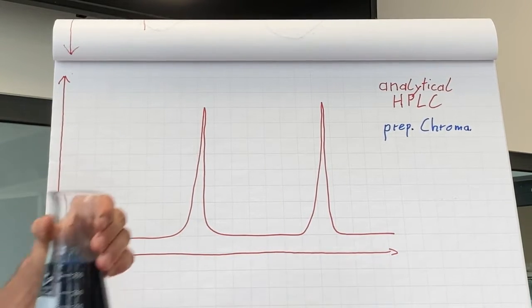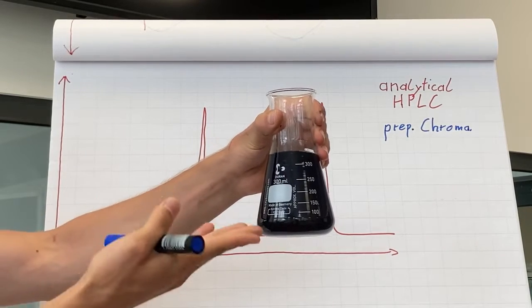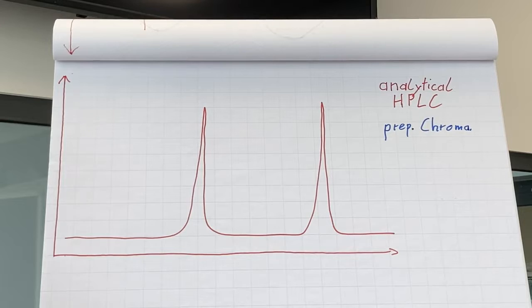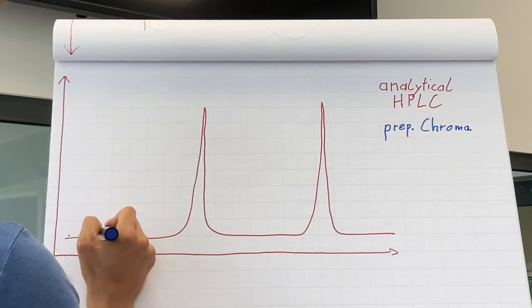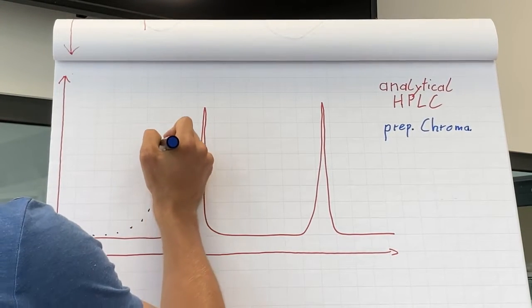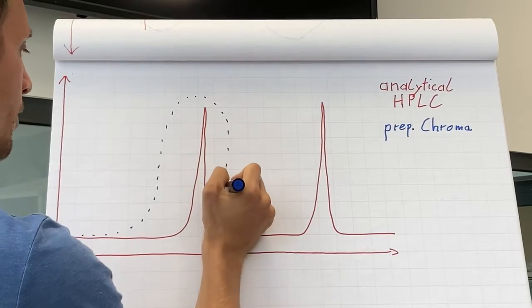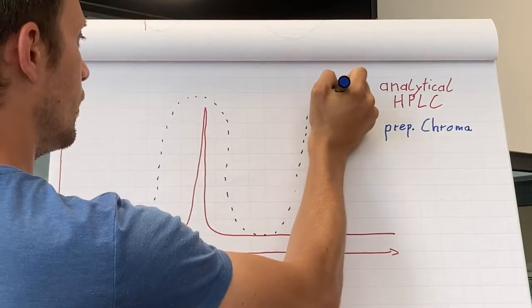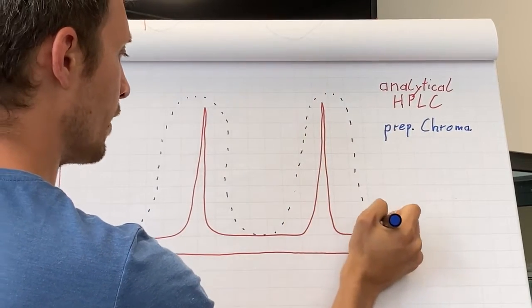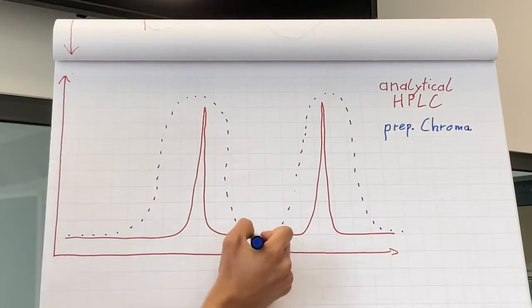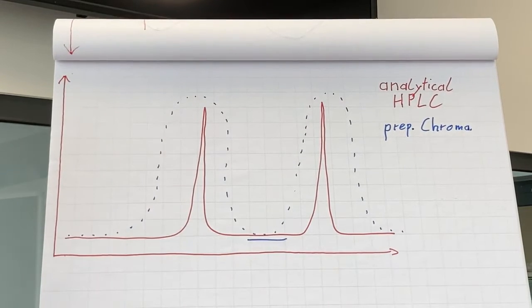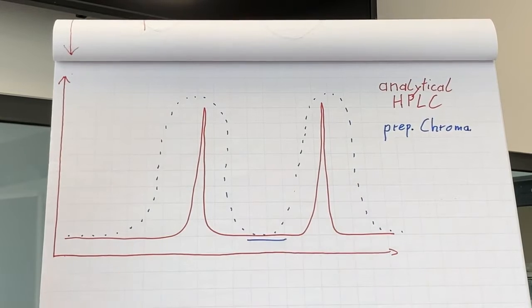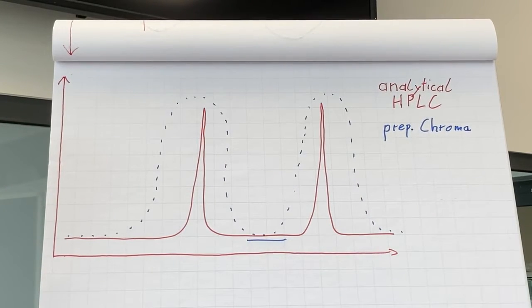But what happens if you inject a high sample volume like this blue solution? We get wide peak shapes. But as you can see, the peaks are still separated. In this case, we are able to collect both fractions with the fraction collector separately.